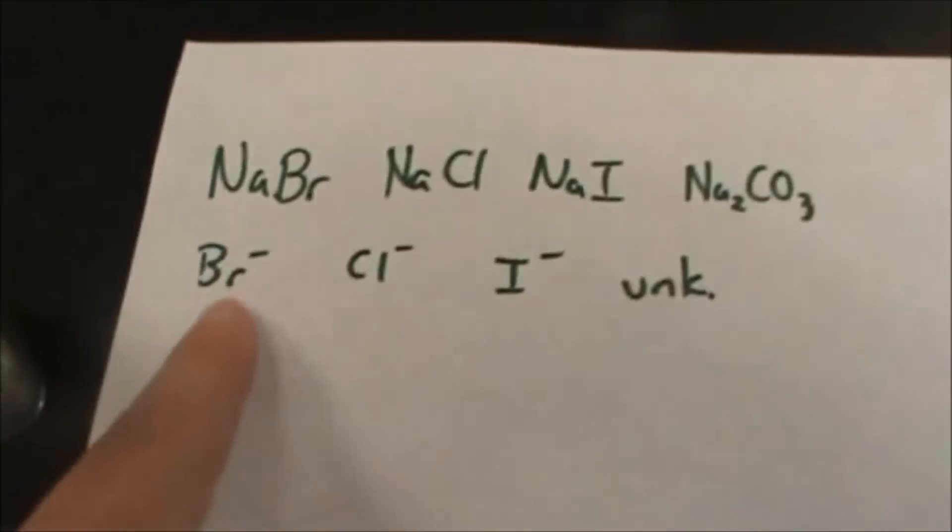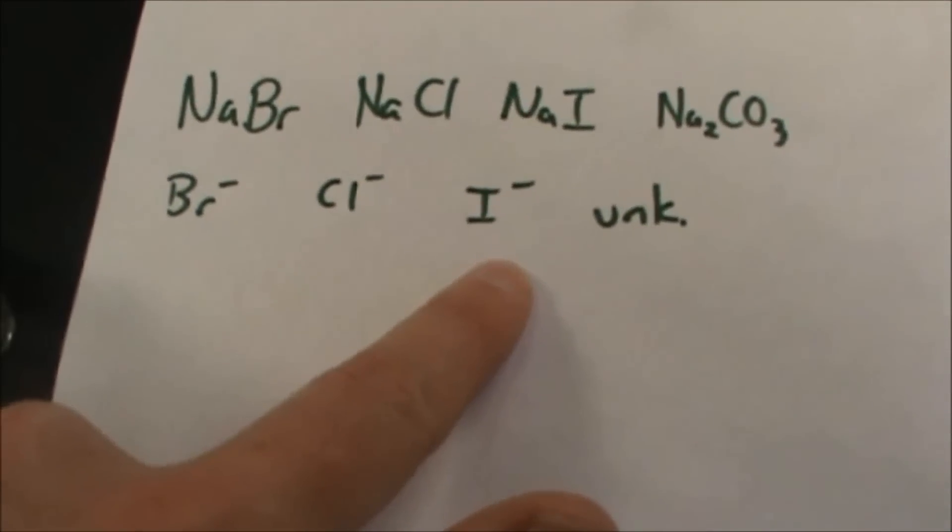So my precipitate here is different than those three. So then I would go on to my next anion test after I've confirmed that. If this were the same as one of those three, then I would know whether I had a bromide, a chloride, or an iodide.